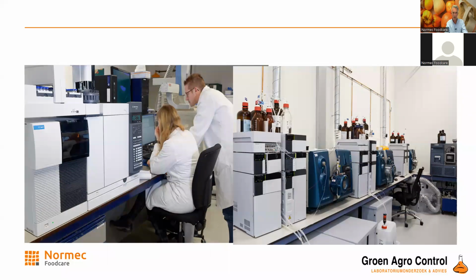There's another laboratory that's based on room temperature, and we also have a lot of equipment to do the test. In our screening, we have more than 750 pesticides, but in the LC we can analyze 400 pesticides. In GC MSMS we can analyze 400, but that means some pesticides are present in both methods. So that's also a double check.